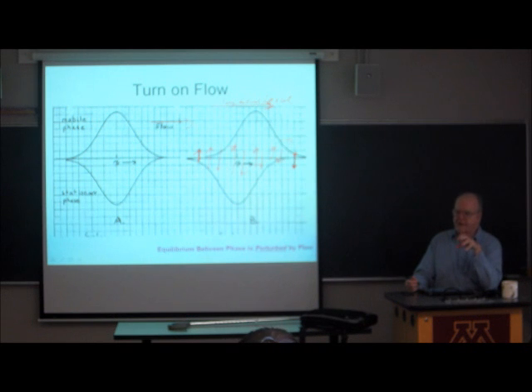So you want the rate of movement radially to be fast compared to the rate of movement axially. Unfortunately, the axial motion is governed by convection, principally, whereas the radial motion is principally governed by diffusion.